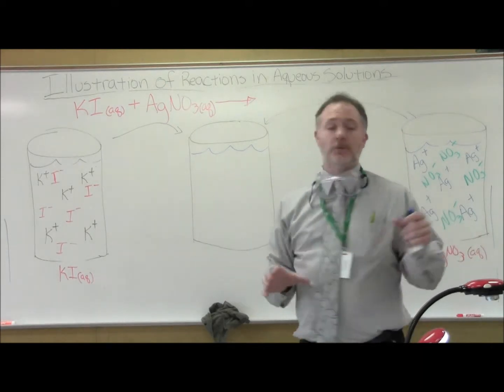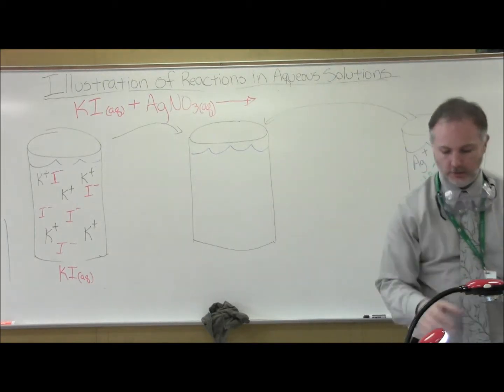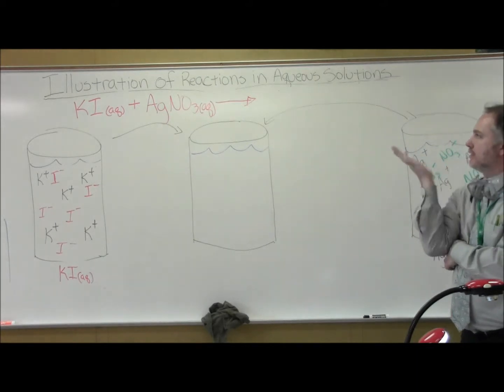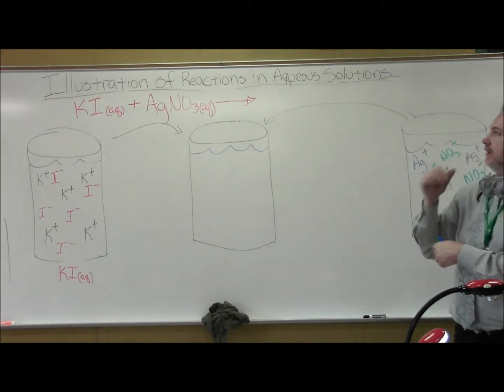Okay. So once again, we're going to pretend one in each hand, and we're going to pour them together. First, before I pour them together, let's figure out what it's supposed to be. Who can tell me one of my new partners? Ag and I.